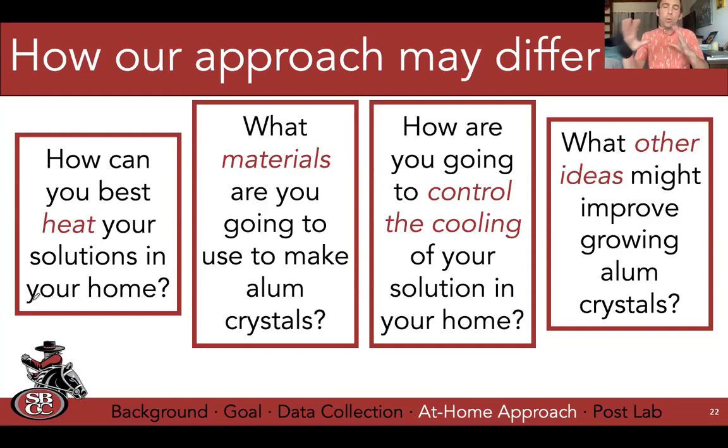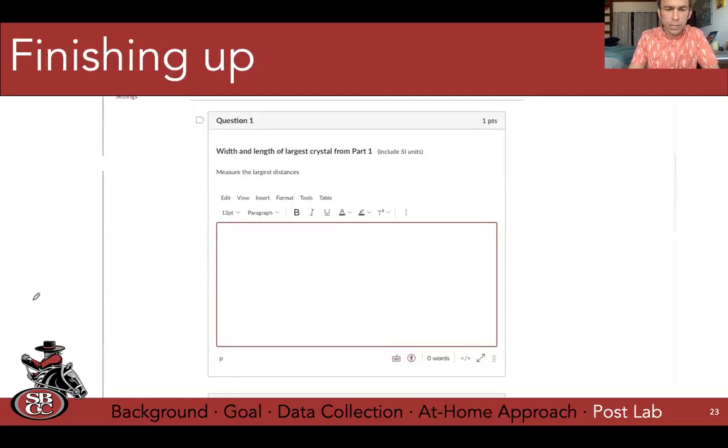The other thing is you don't want to agitate these very much. It's probably not a good idea to put your experiments in the trunk of your car and drive around. Crystals really want that slow temperature change and not to be bumped around or messed with very much as they grow. So keep that all in mind as you approach this.